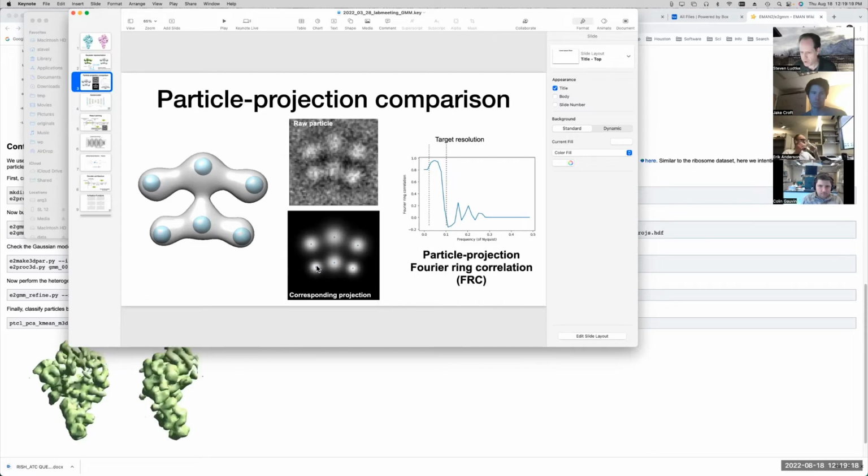So you can compute a gradient which would basically push this Gaussian towards the position that it appears to be in the image. Now the image is only 2D, and this is just a 2D projection of the 3D Gaussian map. So if you do this for any individual particle, you're only going to get 2-dimensional gradients for the 3-dimensional distribution.